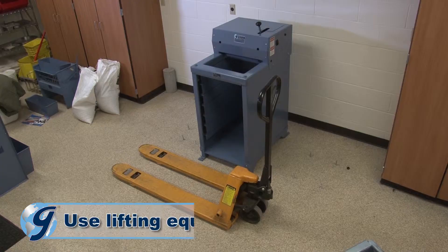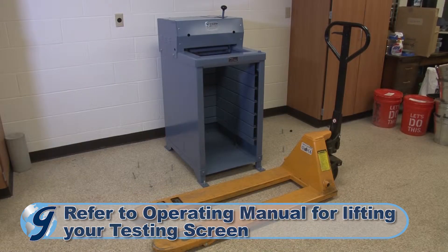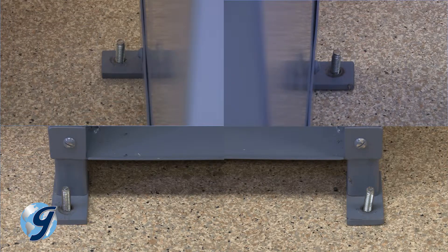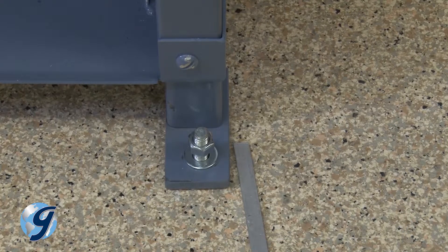Be sure to use lifting equipment to raise and install your testing screen. Using lifting equipment, place the testing screen onto the four anchor bolts so that the threads extend through the holes in the feet, eventually resting the testing screen onto the floor. Once in place, screw the locking nuts loosely onto the anchor bolts to protect the threads while leveling the unit.